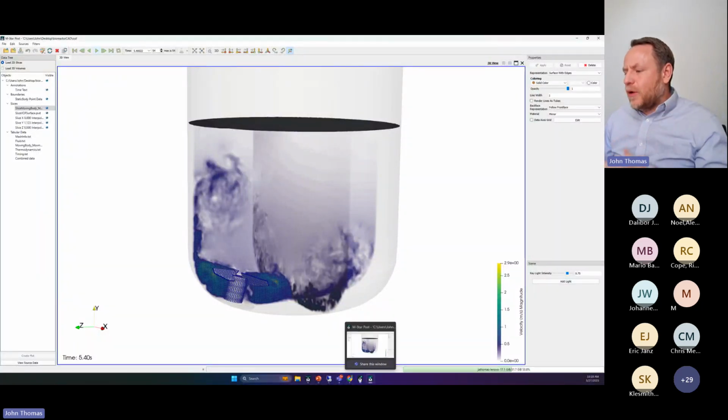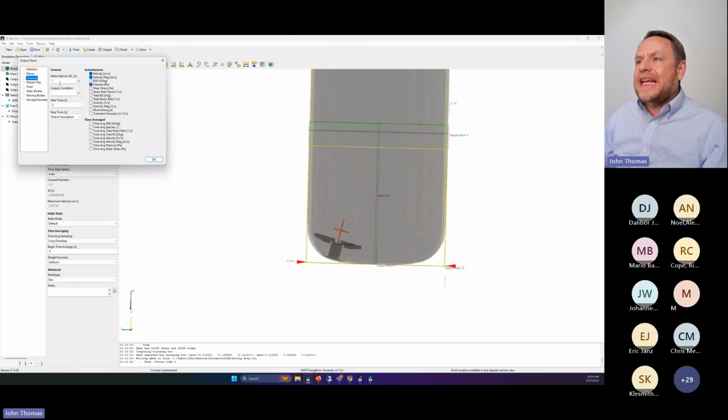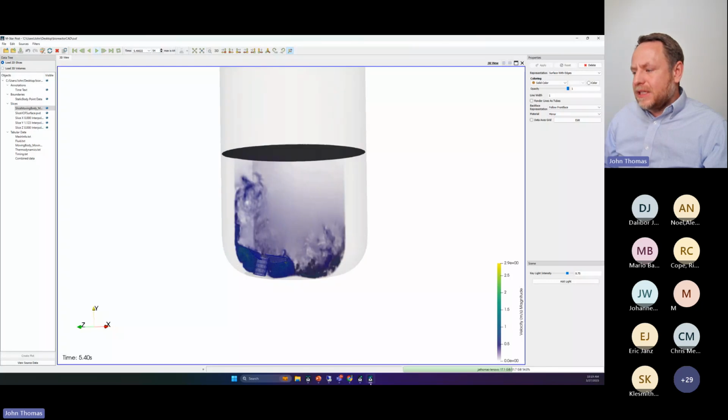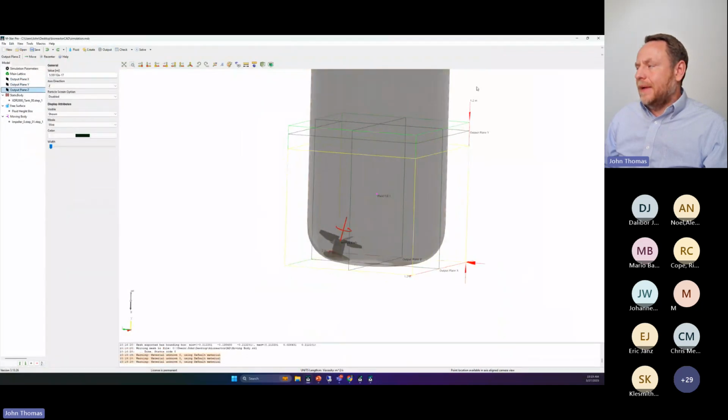Let's go and start adding some more interesting physics. Let's begin adding, for example, something like some strain and EDR. I want to look at EDR and shear stress. Maybe those things interest me. And also just for those keeping score at home, this is fully three-dimensional. I have some output planes here, and those output planes exist because the code graciously gave me a few to start. It gave me a few output planes here where I'm visualizing data.